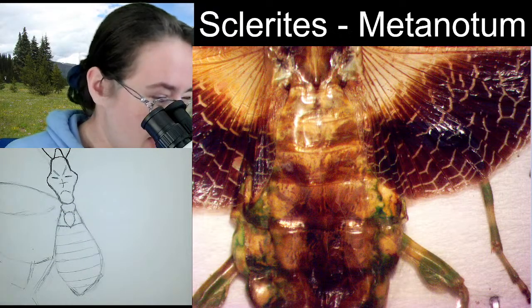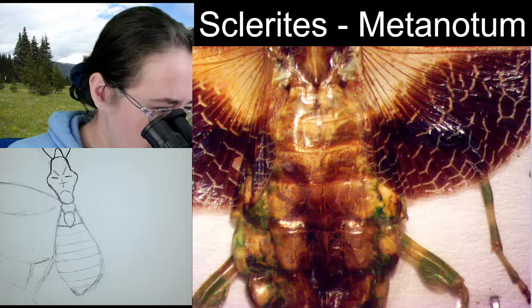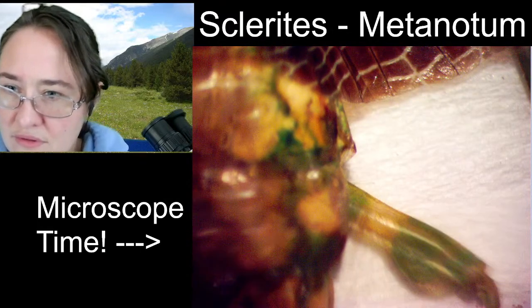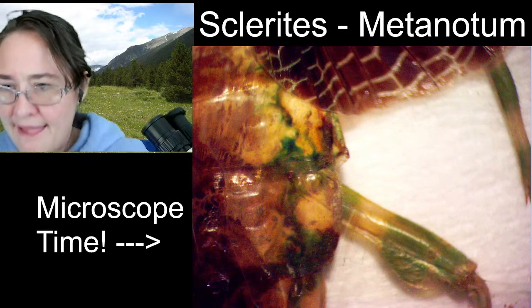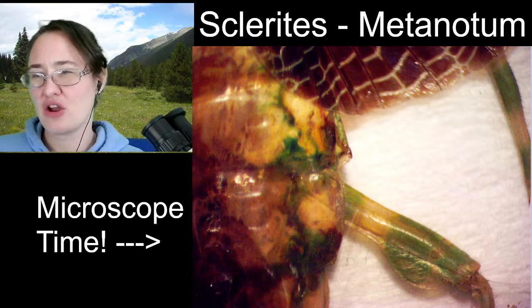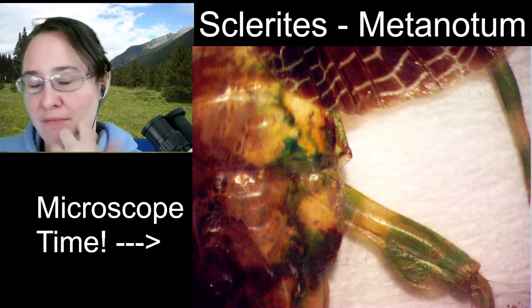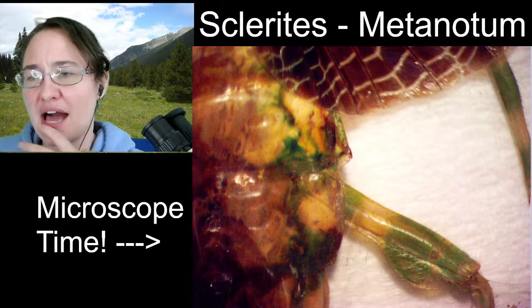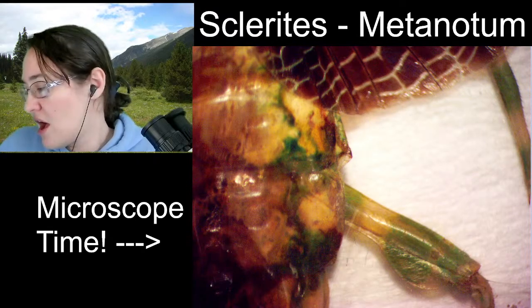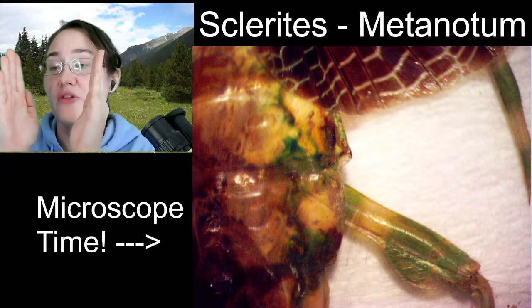And then at the edge of each of these segments, they're kind of bulbous. I'm going to show you this. So, female mantids tend to have kind of squishier abdomens. Their exoskeleton on their abdomen isn't really hard like a beetle. You can almost squish it a little bit. And that makes them bloat a lot, so they can eat a whole lot of food, and their segments get really fat. Then as they digest that food, their segments visibly get thinner. So what we're seeing here is a big fat female, and you can see that those segments are bloated. Those segments can go all the way straight if she was hungry.